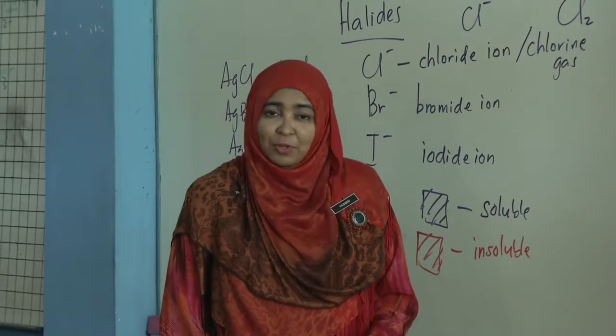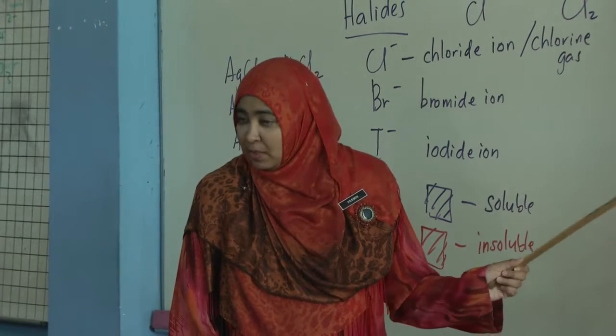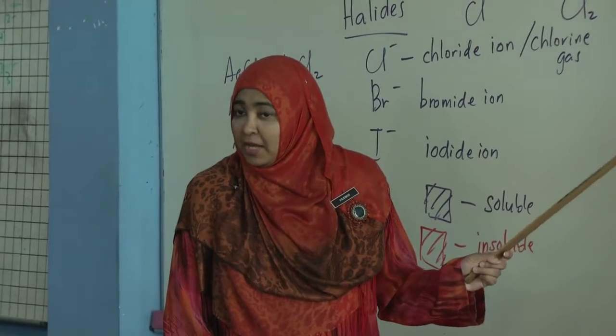No. No. Okay, what about you, Hanif? Teacher, is this a reversible process? Okay, the process is non-reversible. This is a chemical reaction.